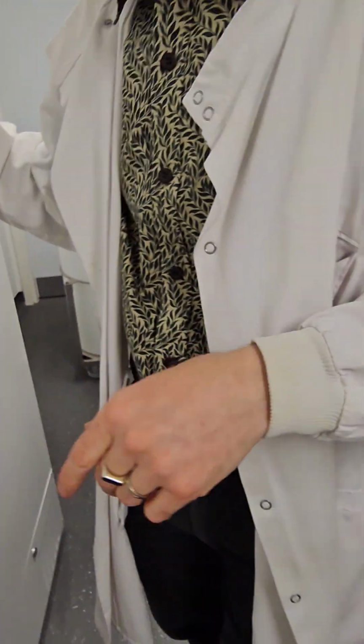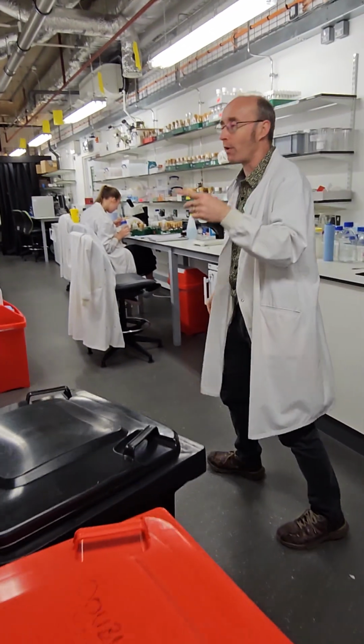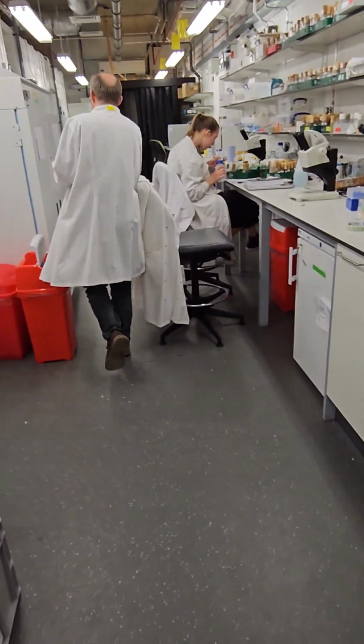Okay, no, so they're the injected ones. So we're making flies and moths that glow as well. Oh, lovely. Different experimental. Yeah.